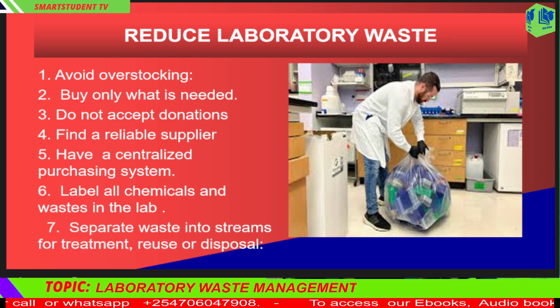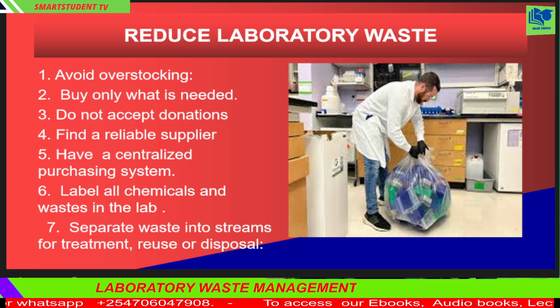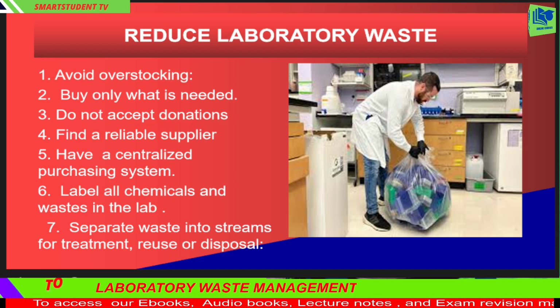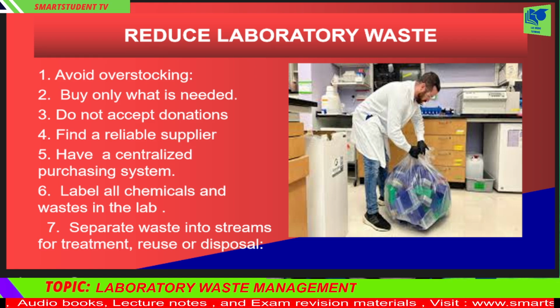7. Separate waste into the following streams for treatment, reuse, or disposal. A. Sharps including scalpels and syringes. B. Broken glassware. C. Biological samples. D. General lab waste. E. Chemical waste. How to reuse laboratory waste.